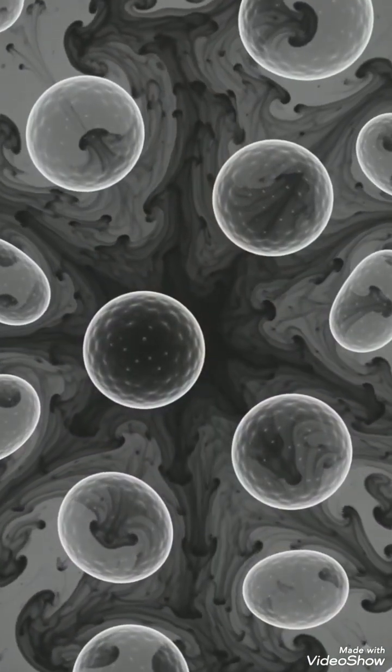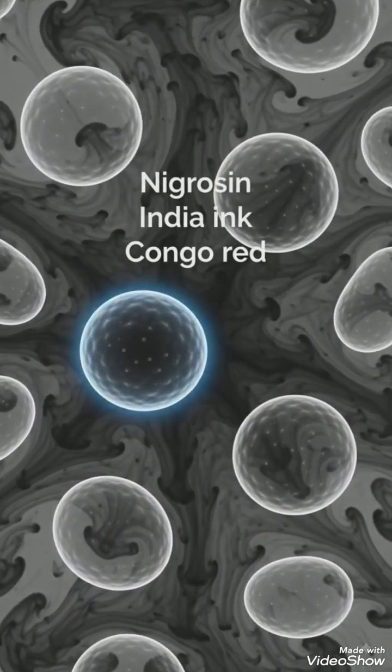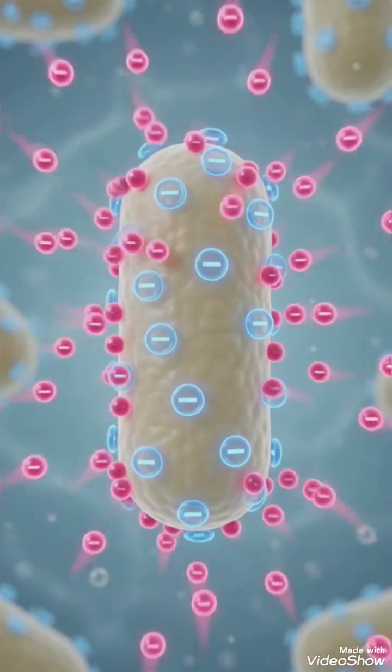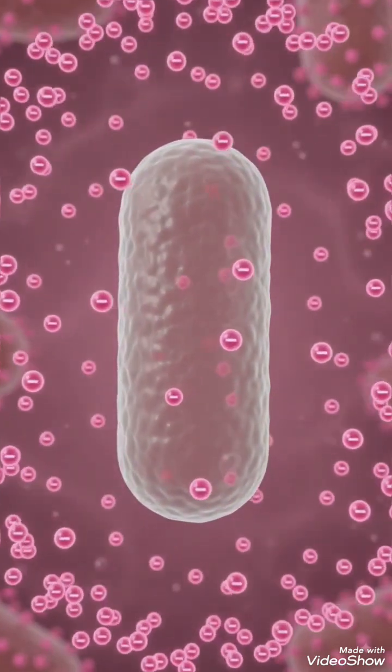In negative staining, the background is stained instead of the cells. Since no heat fixing is required, cell morphology remains undistorted. Acidic dyes possess negatively charged chromophores. Since bacterial surfaces are also negatively charged, the dye is repelled and stains only the background.